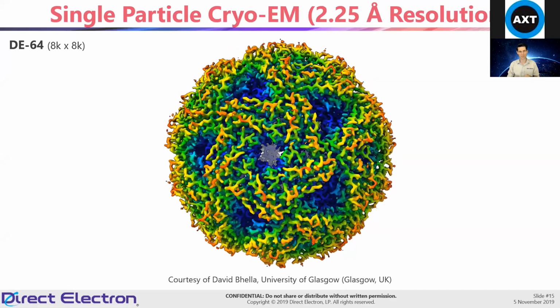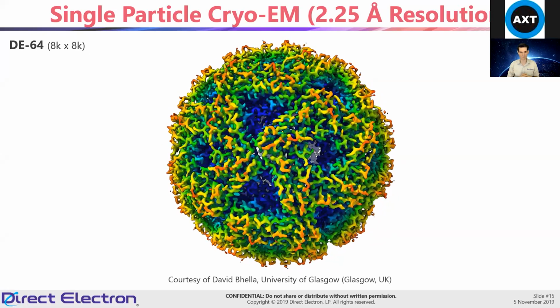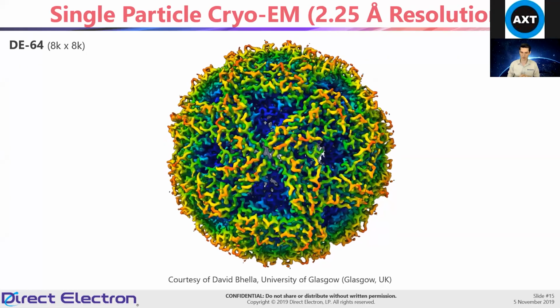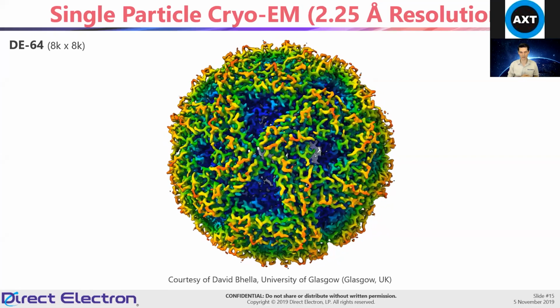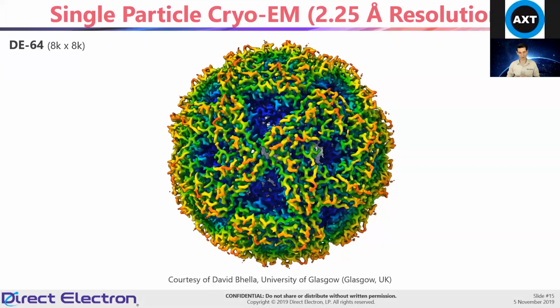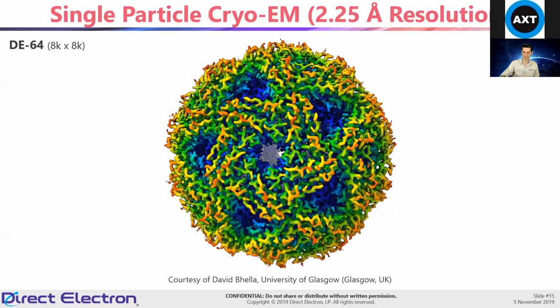It's from about 20,000 particles, and I think they collected for either 1 day and 1 night, or maybe it was 2 days total. This is one of their highest resolution structures, that I think they got earlier this year, and it just shows you that our counting software works quite well, and we can get really, really high resolution very quickly.